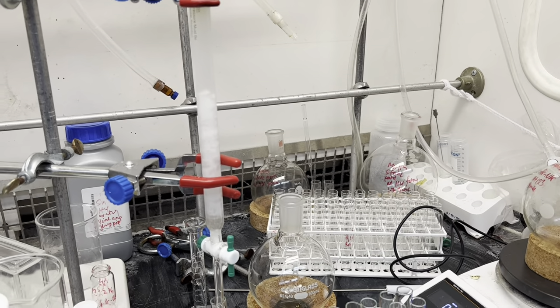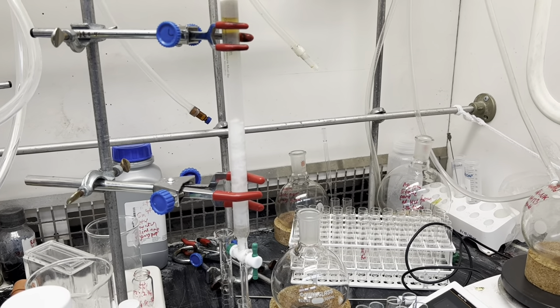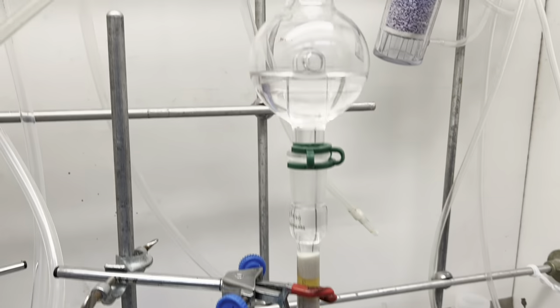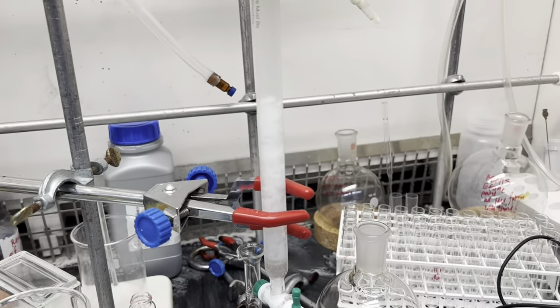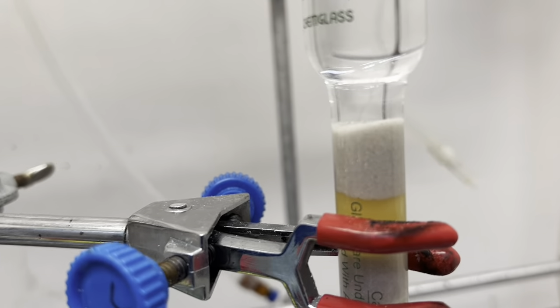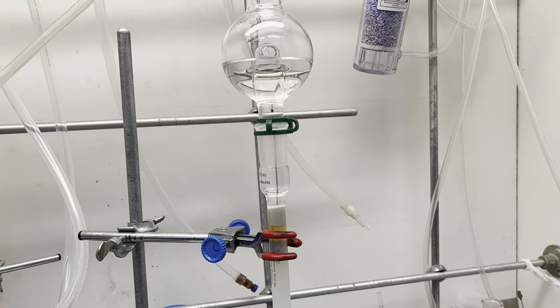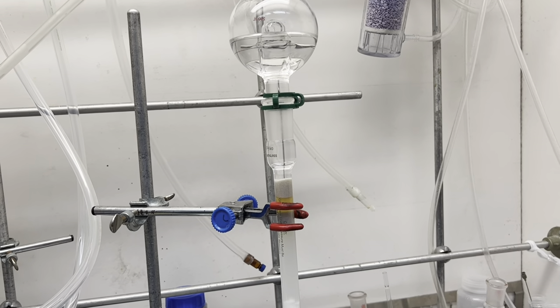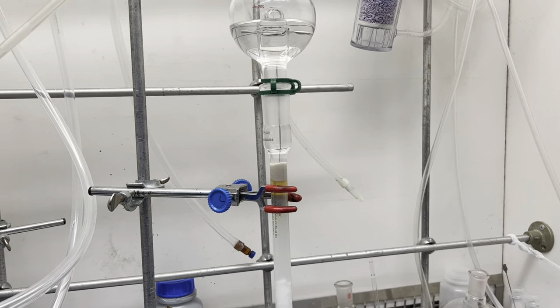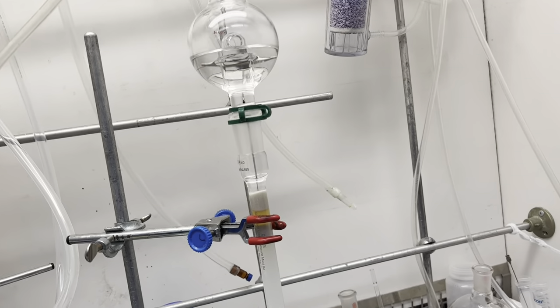Hello everyone, today I'm going to tell you about HPLC, that is called high performance liquid chromatography. Before understanding HPLC, you can see this is a liquid chromatography — this is a manual column I am doing, using liquid as a mobile phase. All of us organic chemists know what is liquid chromatography or column chromatography. But if we add something else to this kind of system to make it high performance, then it will be HPLC.